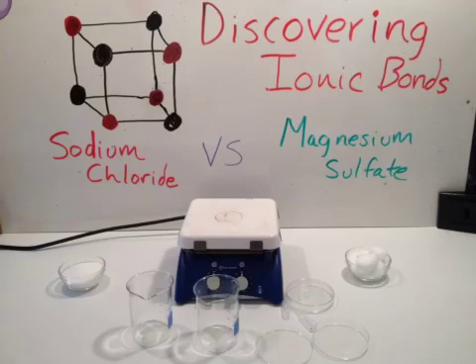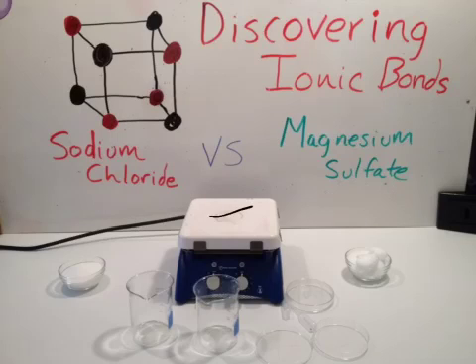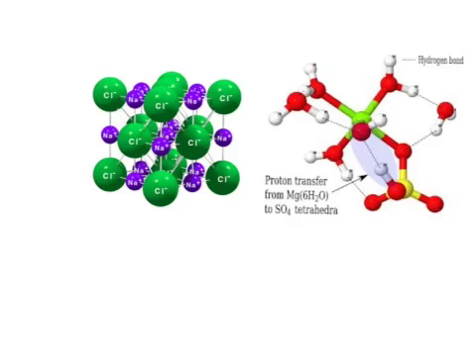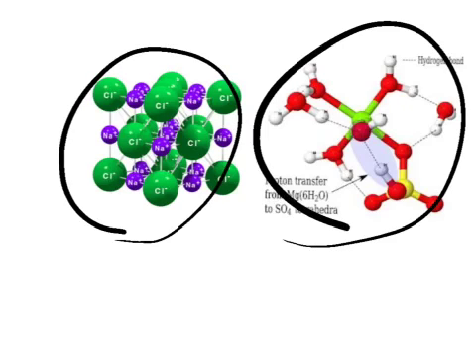Today we're going to learn about discovering ionic bonds, and we're going to use magnesium sulfate and sodium chloride. Some of the tools that we're going to use include the hot plate, petri dishes, beakers, and pipettes. We're going to use these tools to learn about the structure of the sodium chloride molecule and the magnesium sulfate molecule.